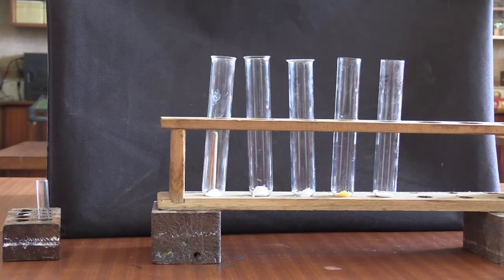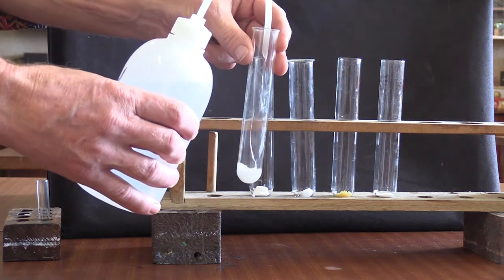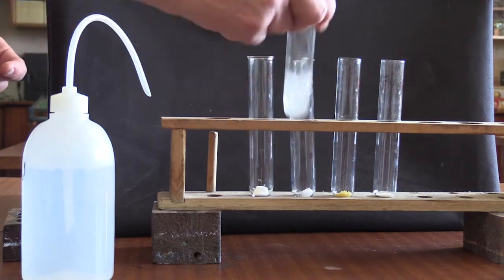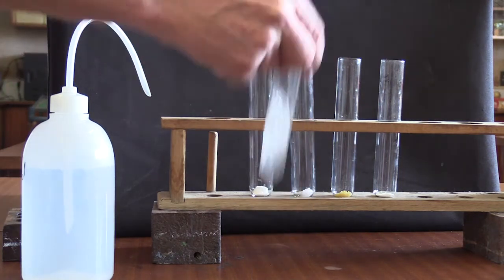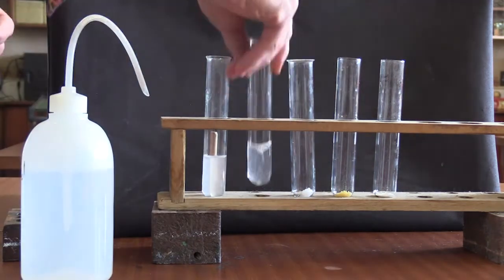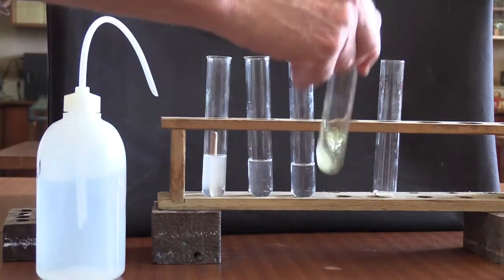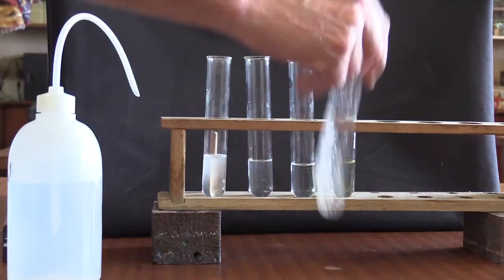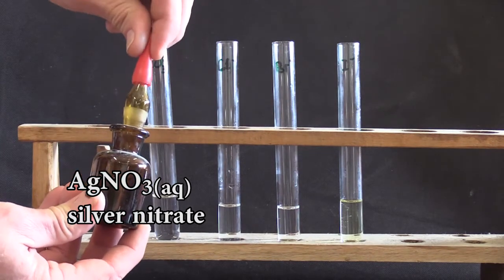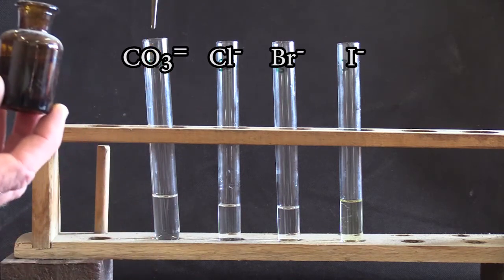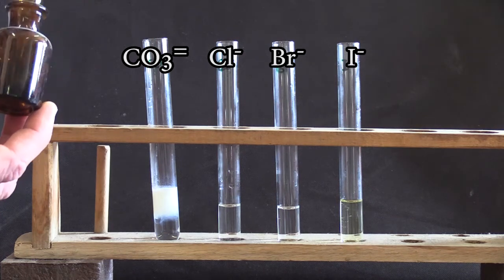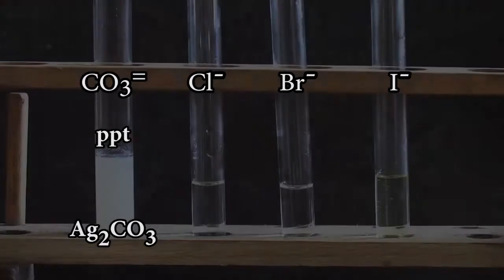Some other reactions. Here we have potassium carbonate. The reason for only using the bottom third of the test tube is that we can shake it quite vigorously and get them to dissolve. And here we have the halides and finally sulfates. Silver nitrate. We add a few drops of silver nitrate to the potassium carbonate and we see this white precipitate of silver carbonate.